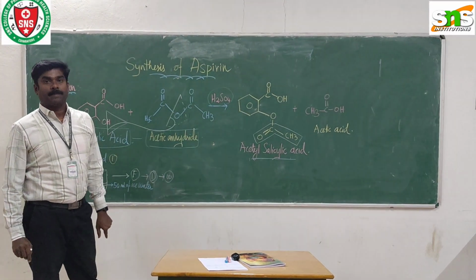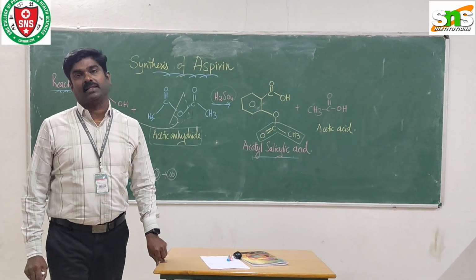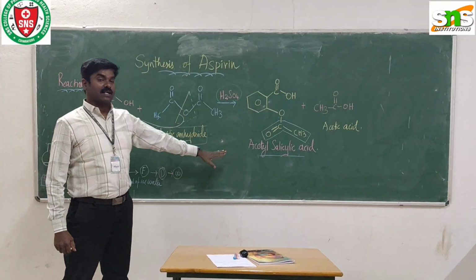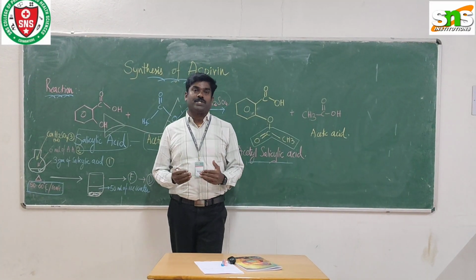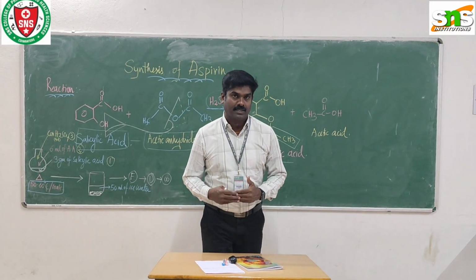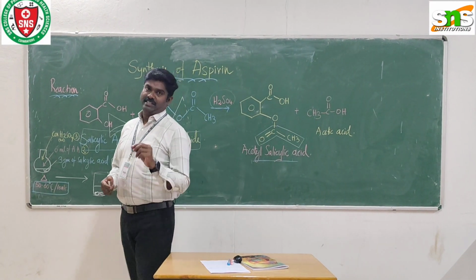H2SO4 is used as a catalyst here. It provides the medium for this reaction, and finally we get acetylsalicylic acid as the final product. Previously we discussed the procedure and principle of aspirin synthesis. Today we are going to see the identification of aspirin.